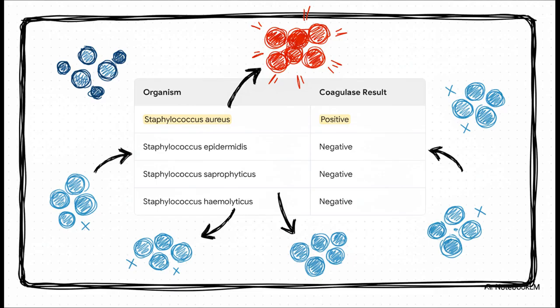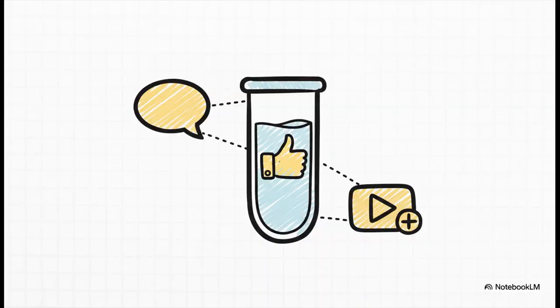It's really that clear-cut. And that's the Coagulase test, a simple, kind of elegant procedure that is still absolutely essential in the clinical microbiology lab for identifying a major pathogen.